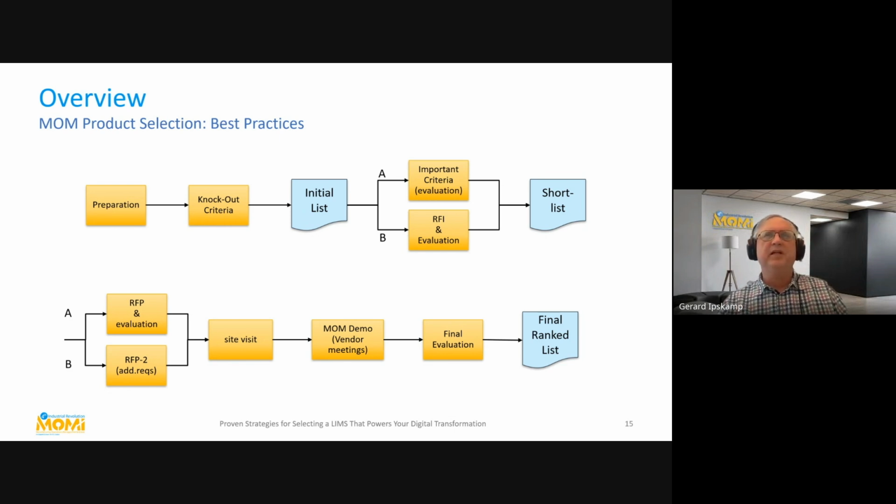If we have already enough information, we go by stream A. We do the evaluation ourselves. The vendor doesn't even know that they are evaluated. And in the end, we present to the stakeholders the shortlist with the argumentation why that is a good shortlist.